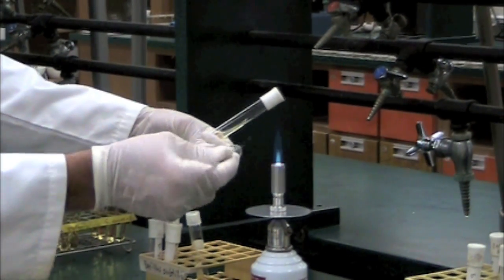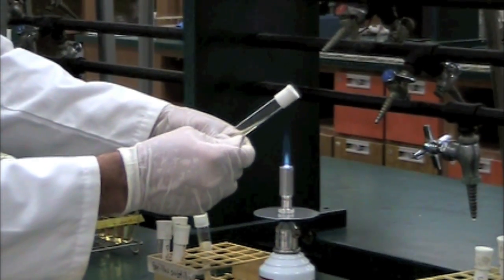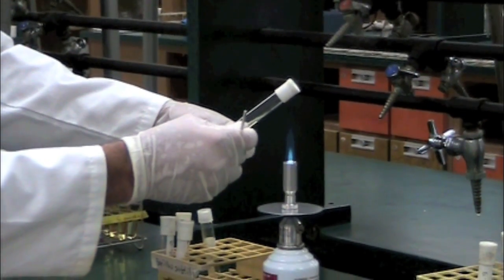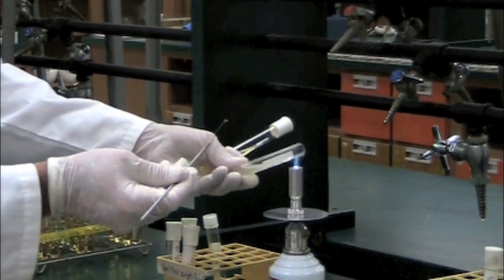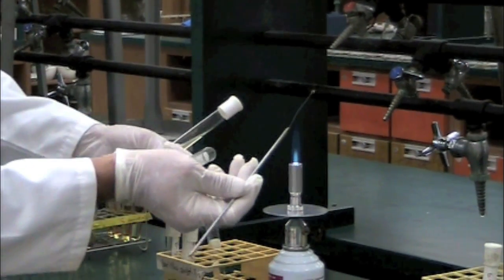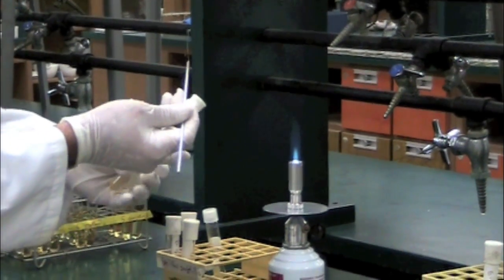I'm going to take my loop, which is now cooled. I'm going to insert it into the tube and take a sample on the end of my inoculating loop. I'm going to retorch my tube and recap it. All right, notice I work basically around the flame.